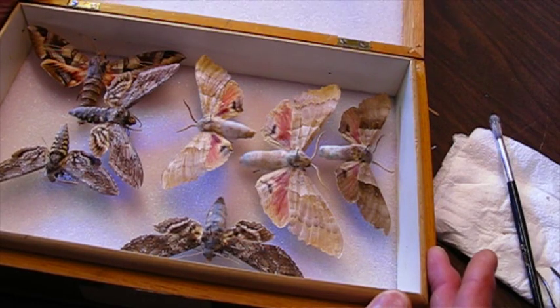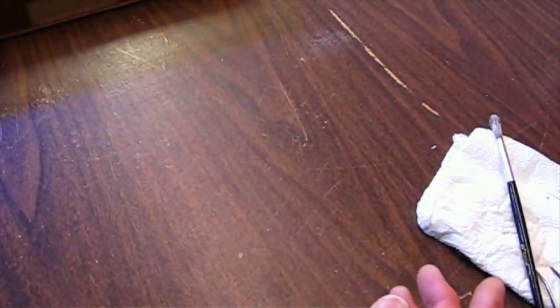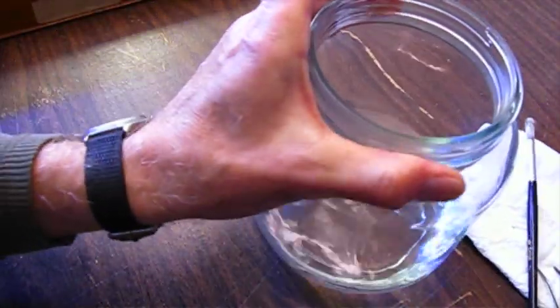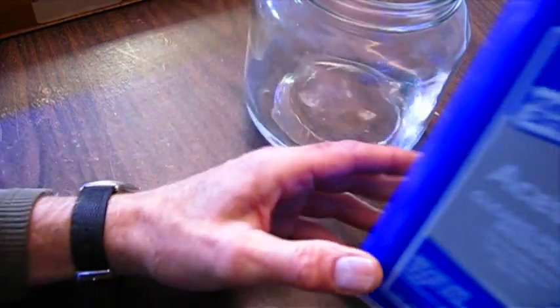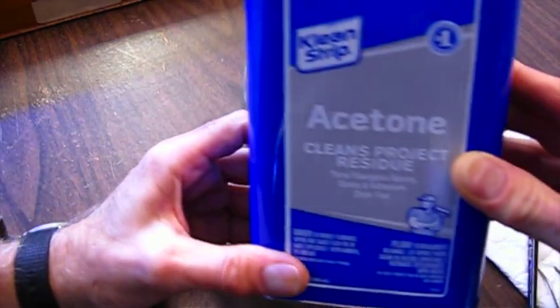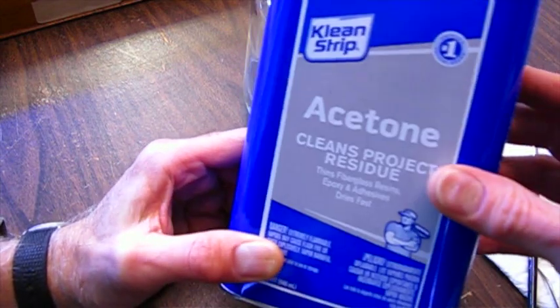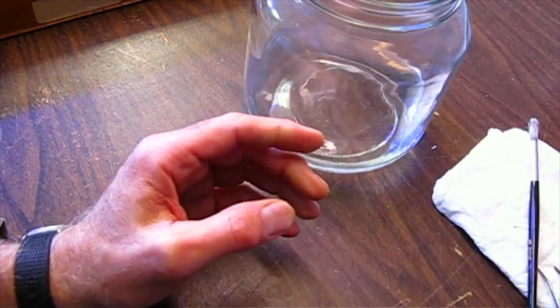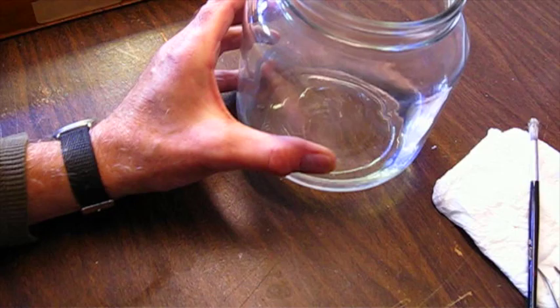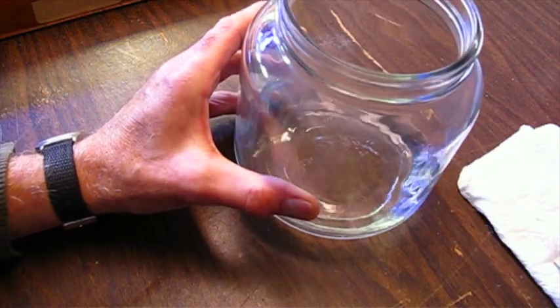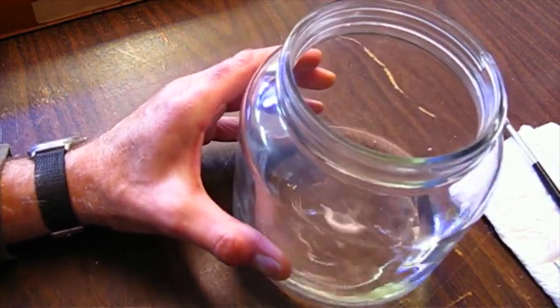I use acetone for this, so I'm going to show you what I've developed. I have a jar of acetone here. Acetone is a solvent, it's flammable and toxic, so you want to be careful with it. I'm in a fairly large room, it's pretty well ventilated, so I'm not too worried about it right now.